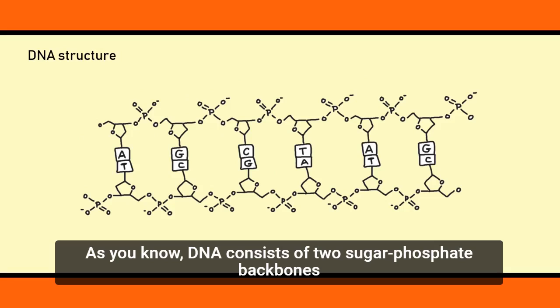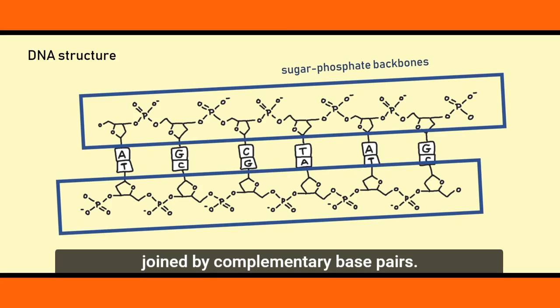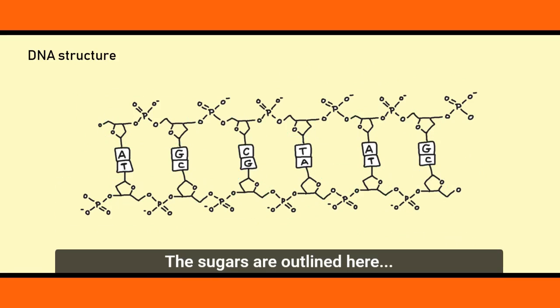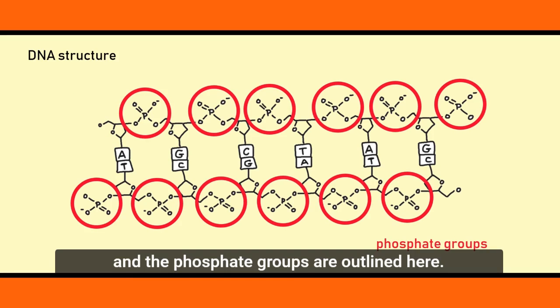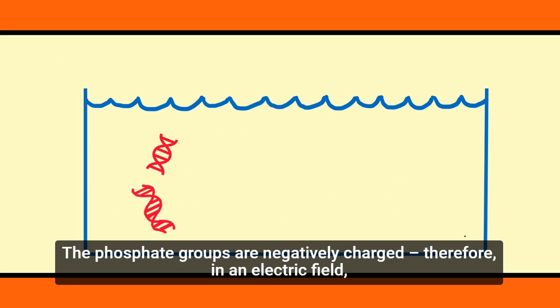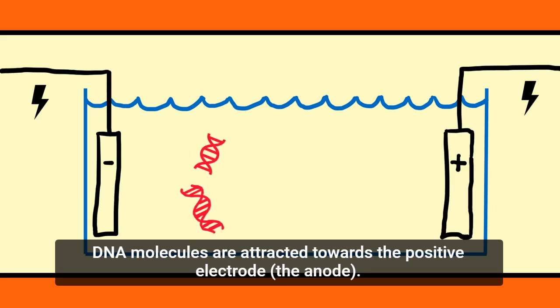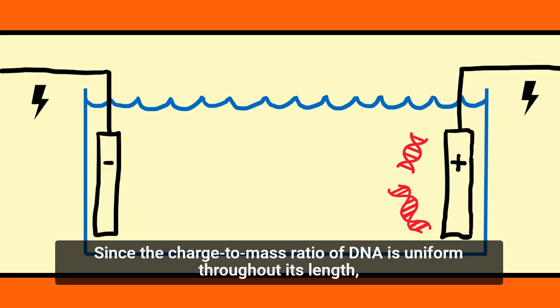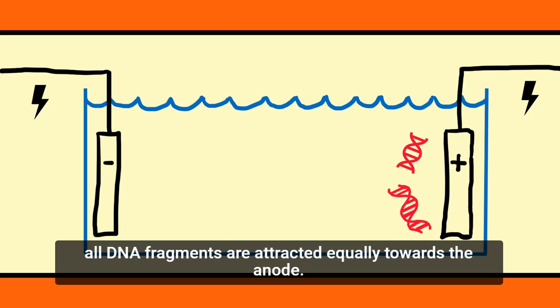As you know, DNA consists of two sugar phosphate backbones, joined by complementary base pairs. The sugars are outlined here, and the phosphate groups are outlined here. The phosphate groups are negatively charged. Therefore, in an electric field, DNA molecules are attracted towards the positive electrode, the anode. Since the charge-to-mass ratio of DNA is uniform throughout its length, all DNA fragments are attracted equally towards the anode.